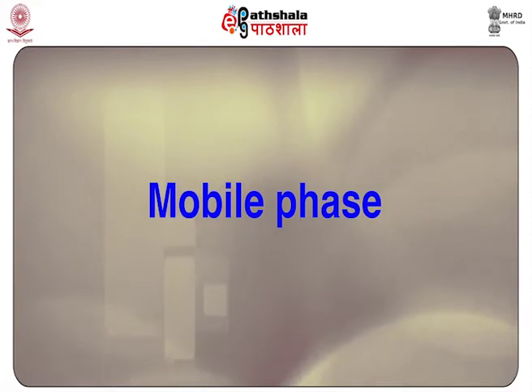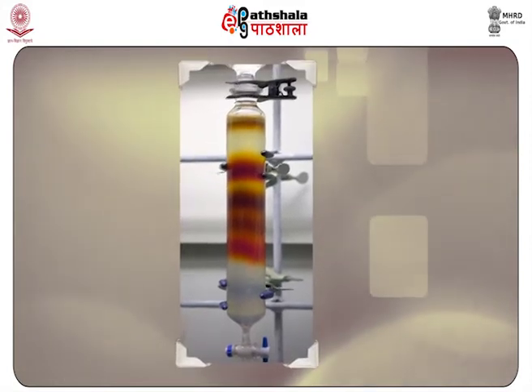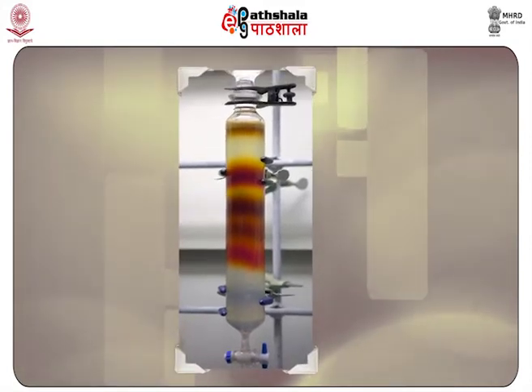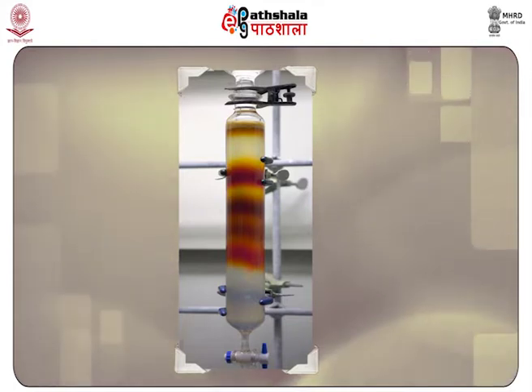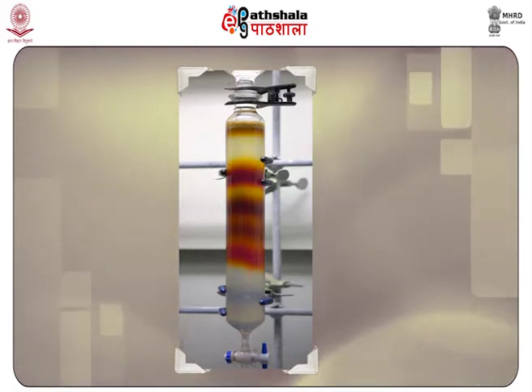Now, the mobile phase. A single or a mixture of solvents could be used as mobile phases. The nature of the compound under analysis affects the choice of the mobile phase. A correct choice of mobile phase can give accurate results with a higher degree of resolution.